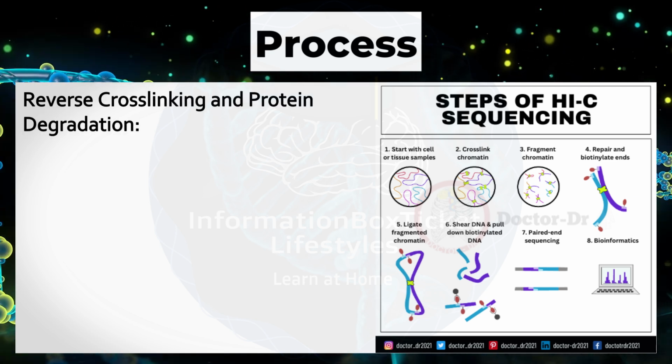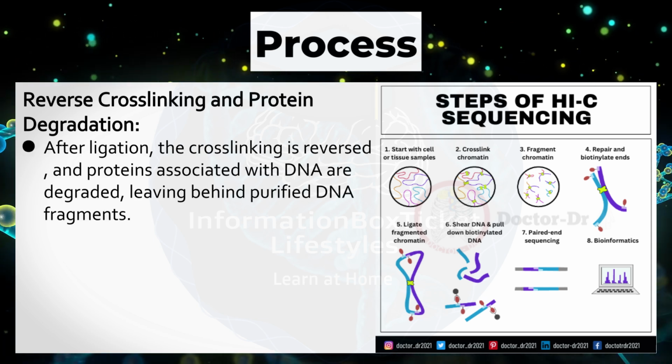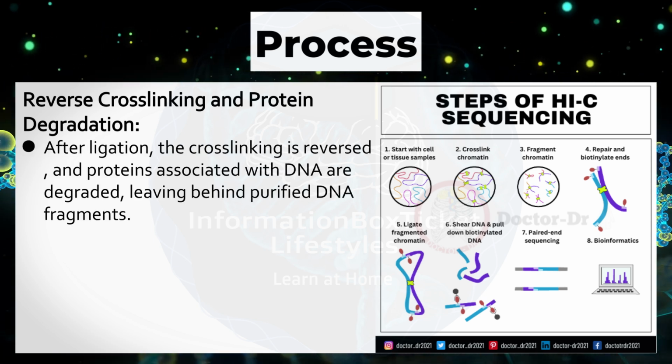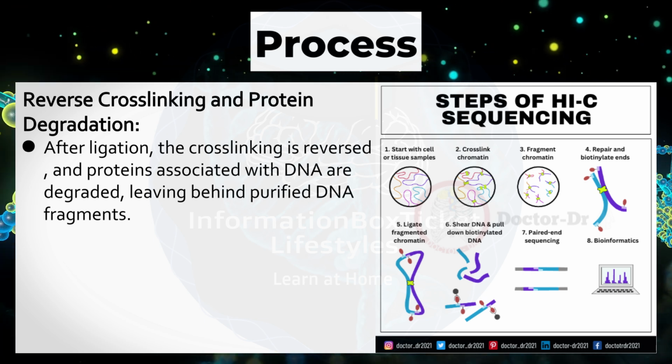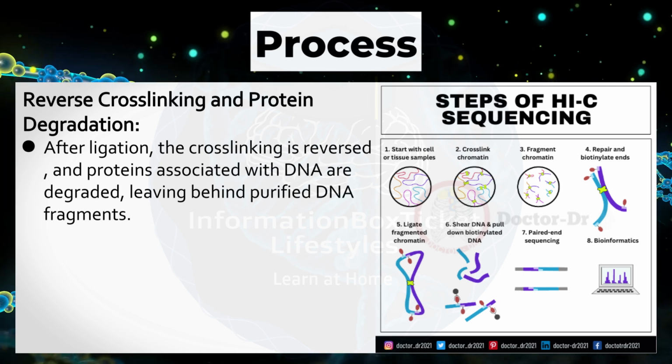Reverse cross-linking and protein degradation. After ligation, the cross-linking is reversed, and proteins associated with DNA are degraded, leaving behind purified DNA fragments.